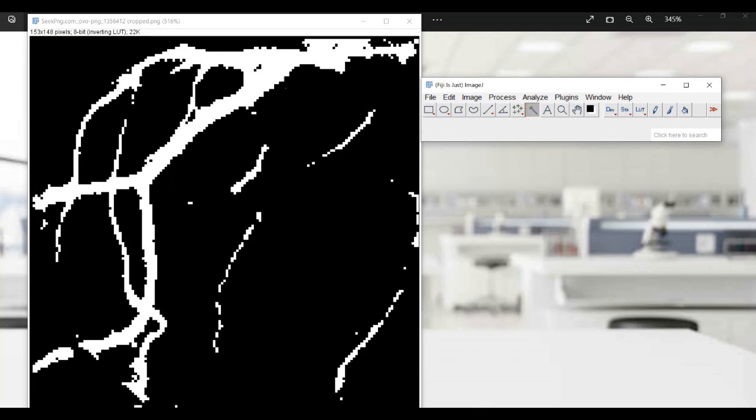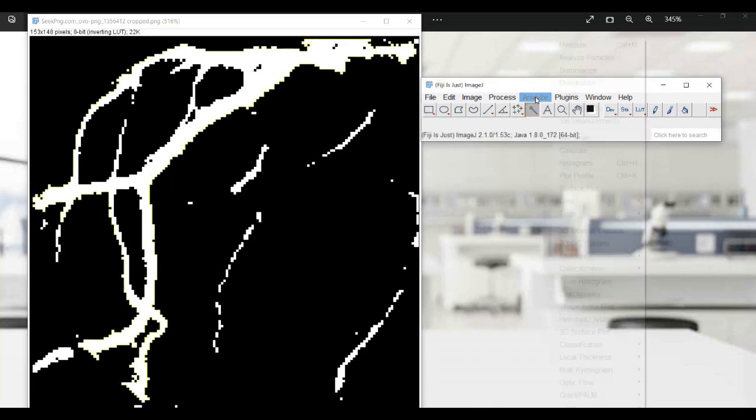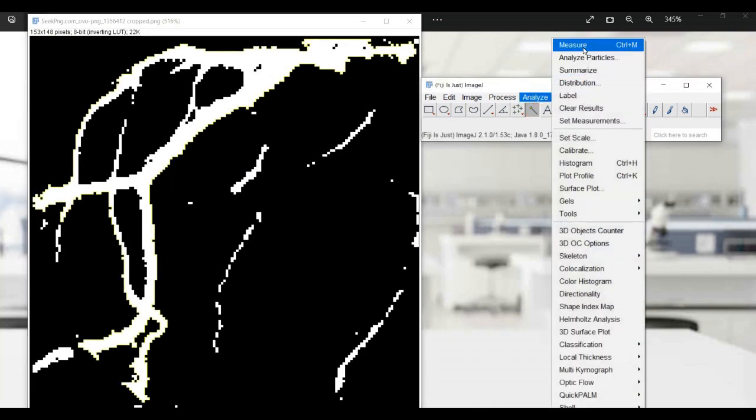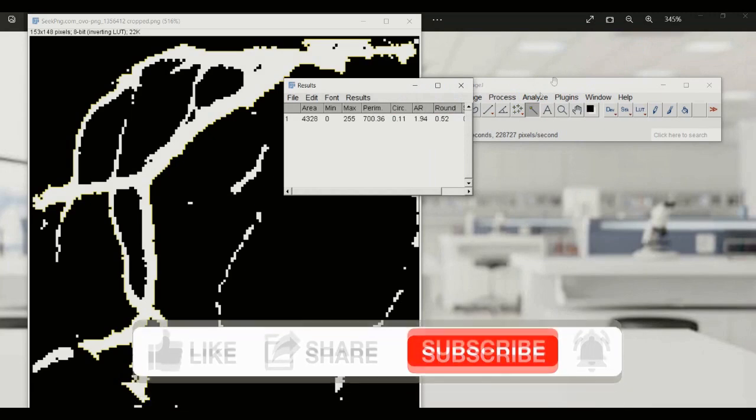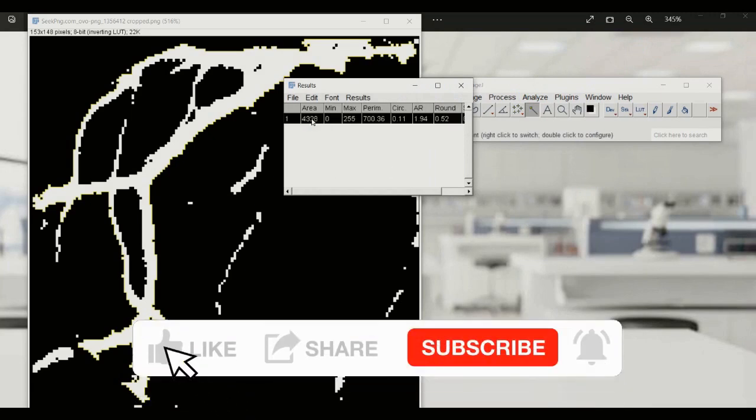Once you've measured the blood vessel area in each of your images, you can compare the results to determine the efficacy of your treatment.